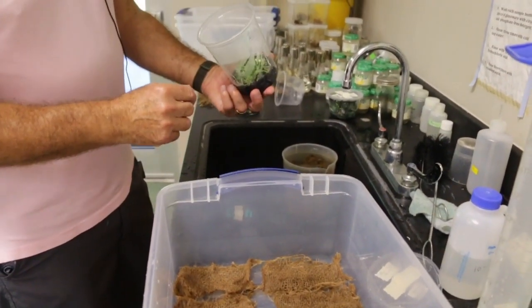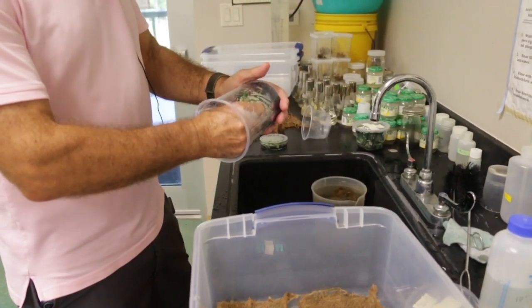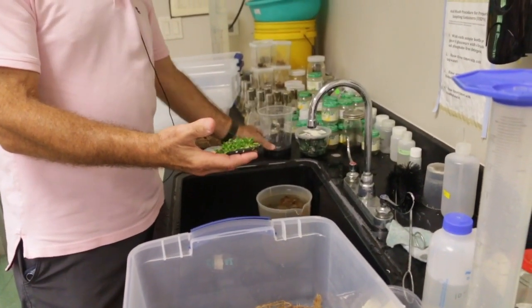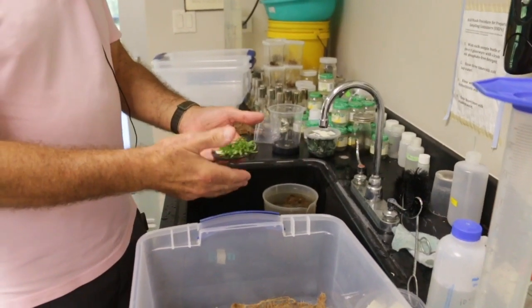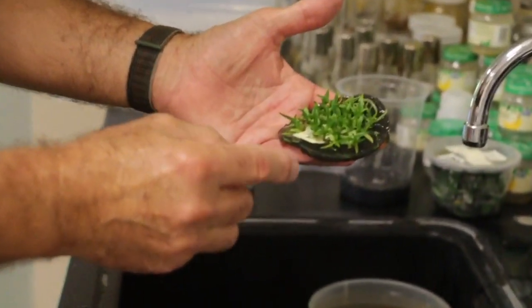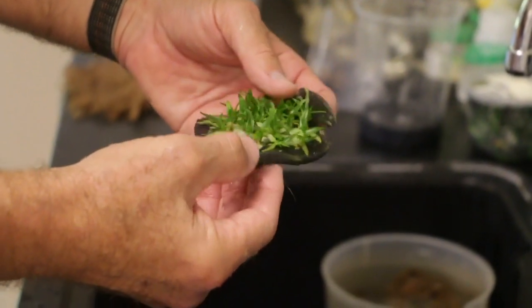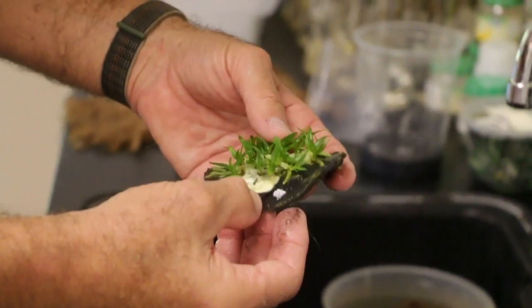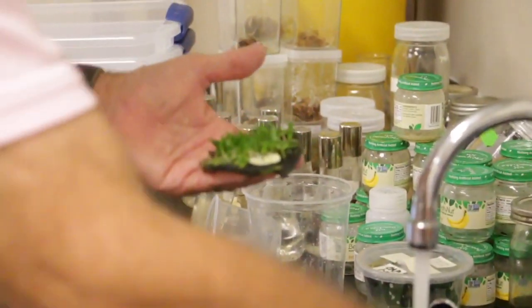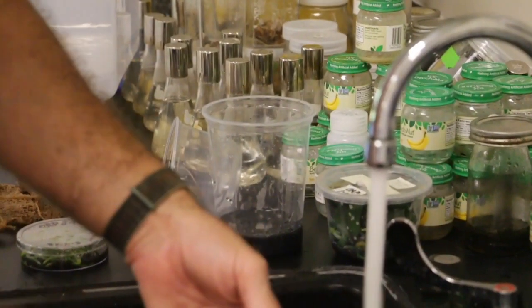All right, so let's just pull this stuff out, and I can tell this is not going to go well. These are small plants, and this is what I did. All right, so this is what slid out of the dish just a few days ago, and then I put it into that flask, and then this contamination that I didn't see before grew out, and it grew really quickly. So let's wash this stuff off and see what we get.